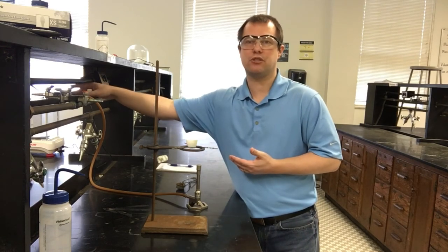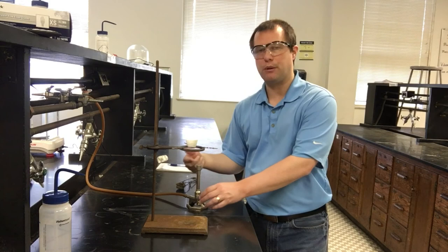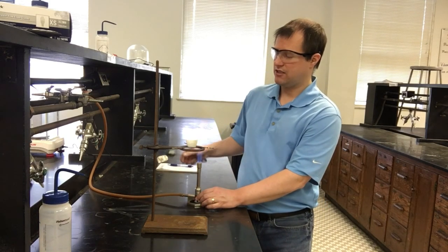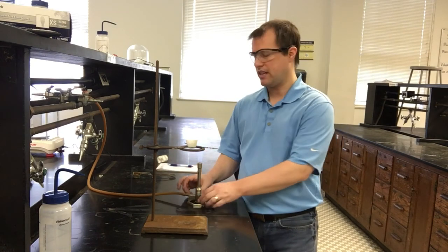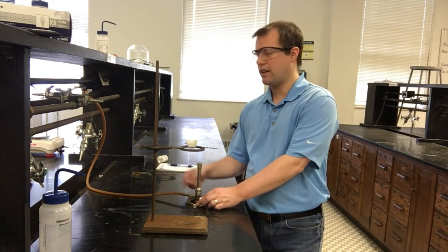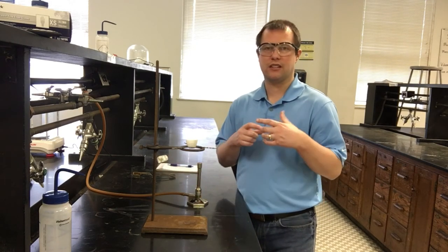To turn on the Bunsen burner, open the gas line valve by turning the knob handle so it's in line with the spigot. You should hear a slight hiss of gas. Then take a sparker right over where the gas is coming out, spark it, and you have a flame. You can control the flame in two ways: at the very bottom to regulate gas flow, and on top to regulate airflow. Both influence the size and color of the flame.